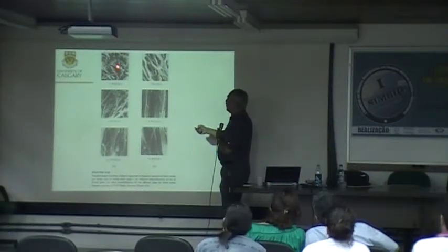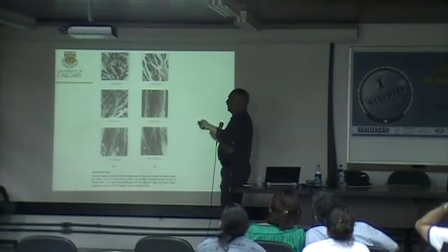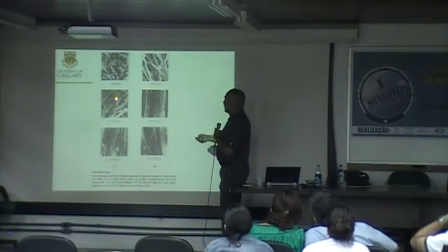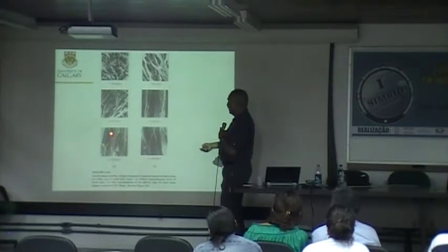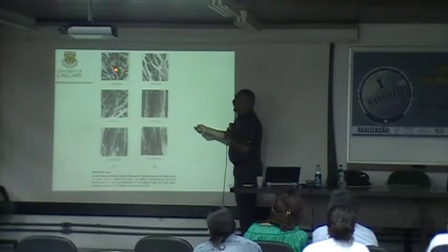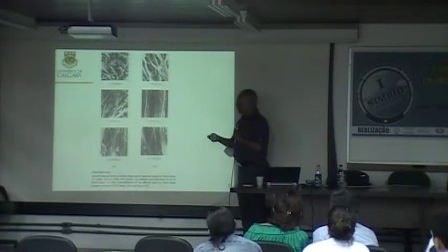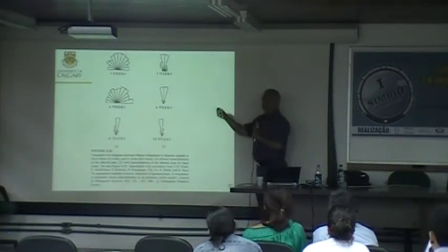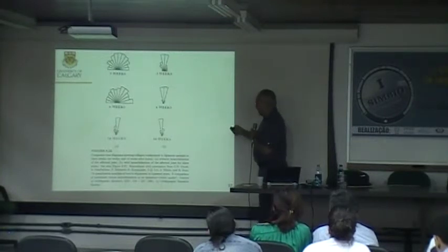So here, without immobilization, 3 weeks. At 3 weeks, there is no order. 6 weeks, there is not much order, but here, there is good order. 14 weeks, almost the same. So with immobilization, there is a quicker return to order. And this is the average over many images and a few rabbits.